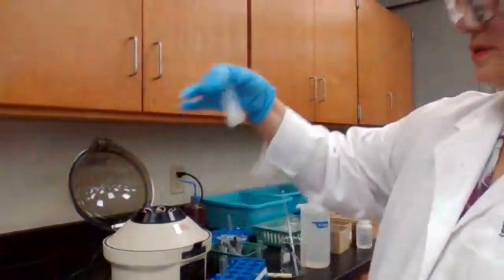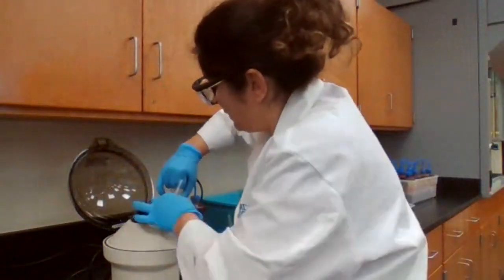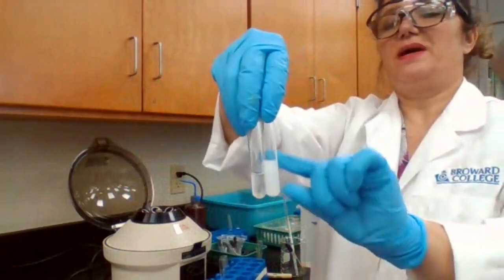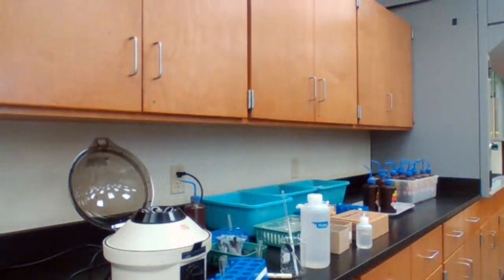So we are going to centrifuge. The size is not the same. For the 2 test tubes, I have to make sure to add more water to the other test tube to make it even.